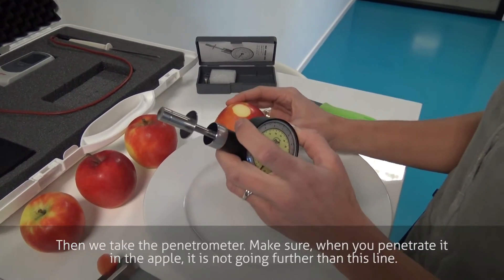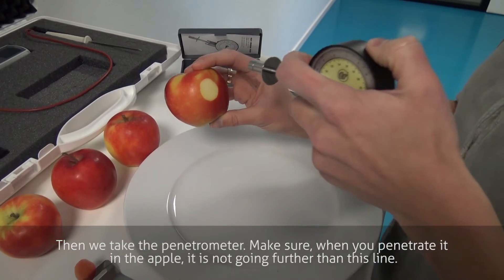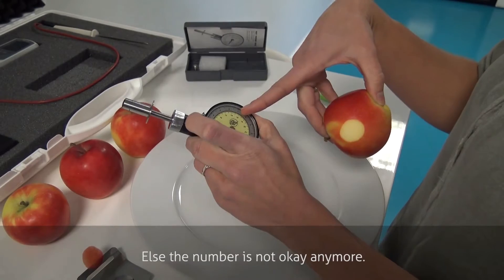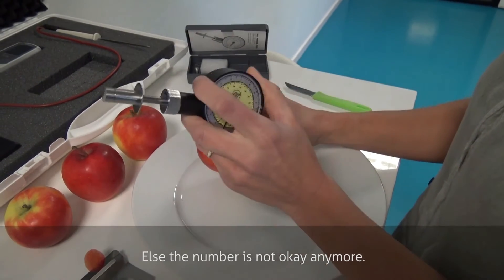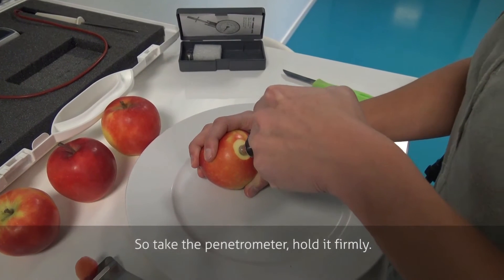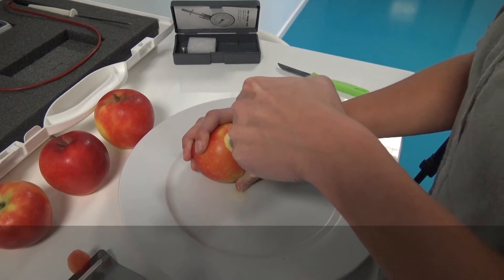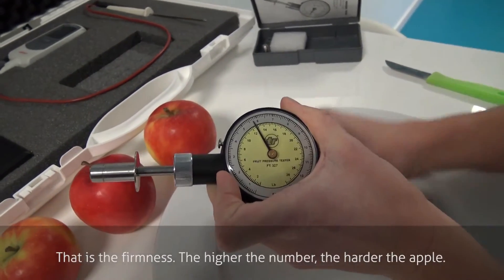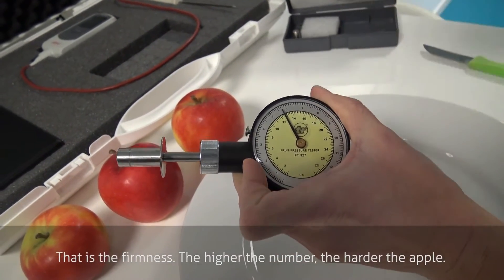Then we take the penetrometer. Make sure when you penetrate it into the apple, it's not going further than this line, or else the number is not okay anymore. Take the penetrometer, hold it firmly. That's the firmness — the higher the number, the harder the apple.